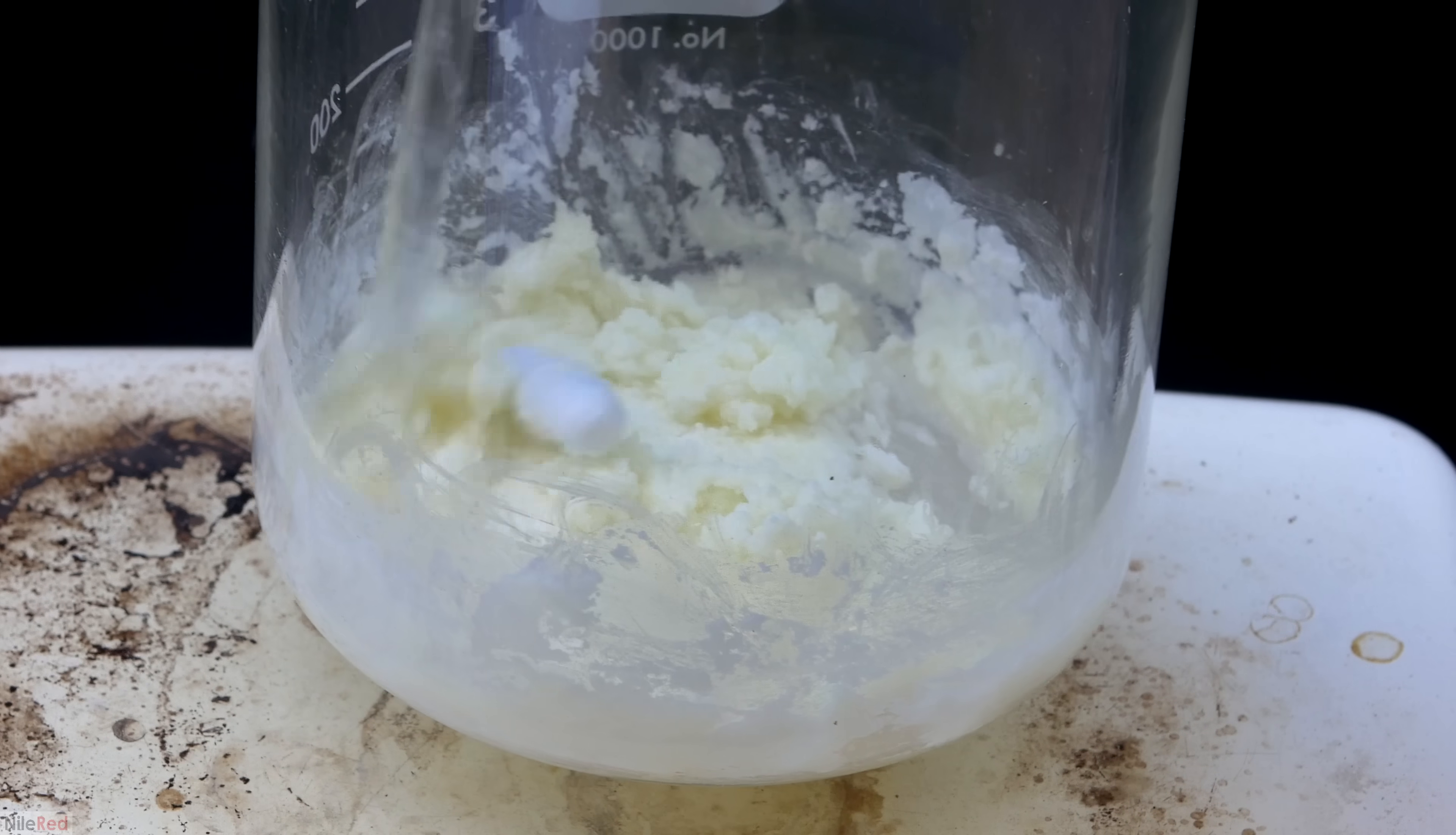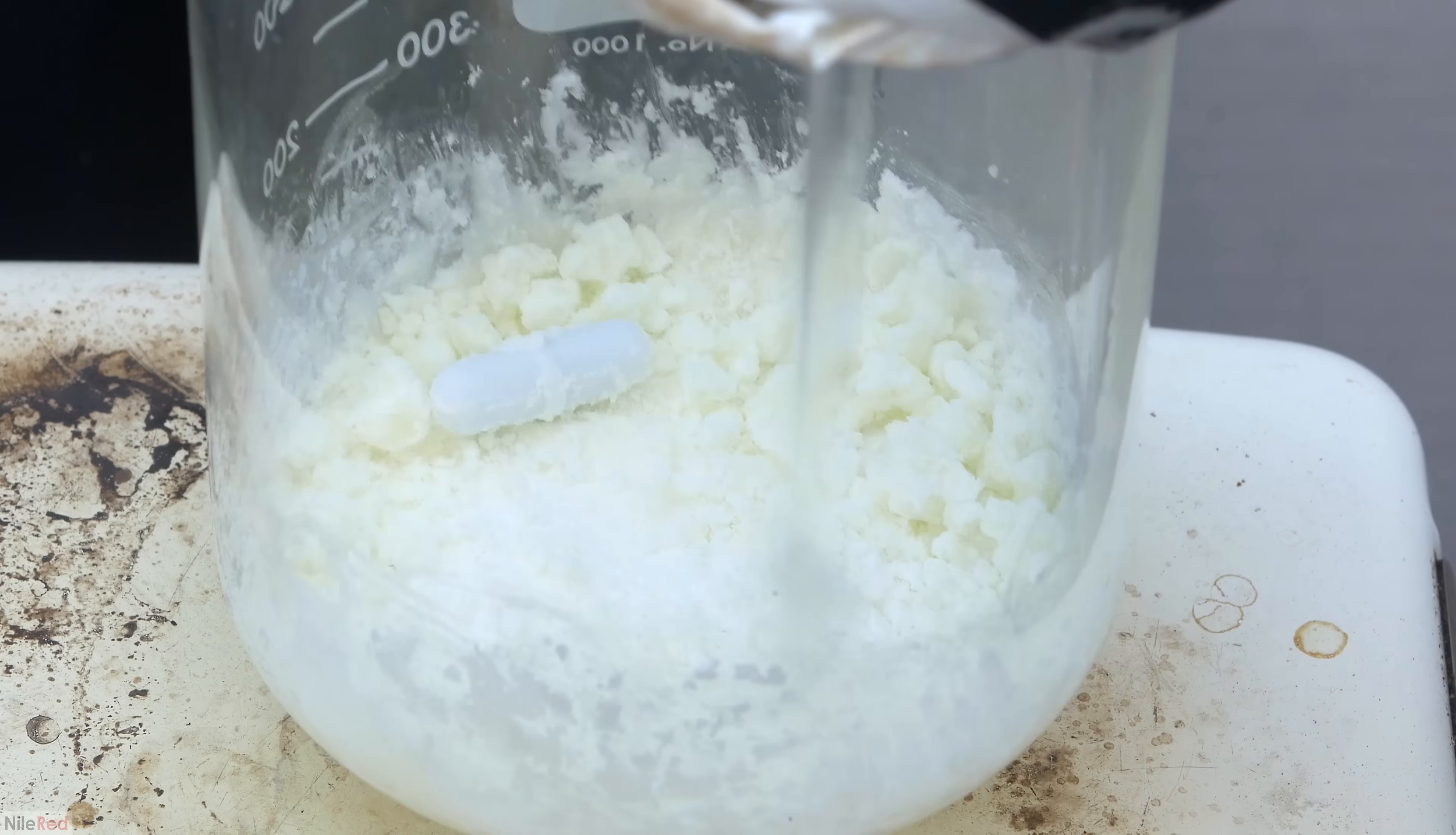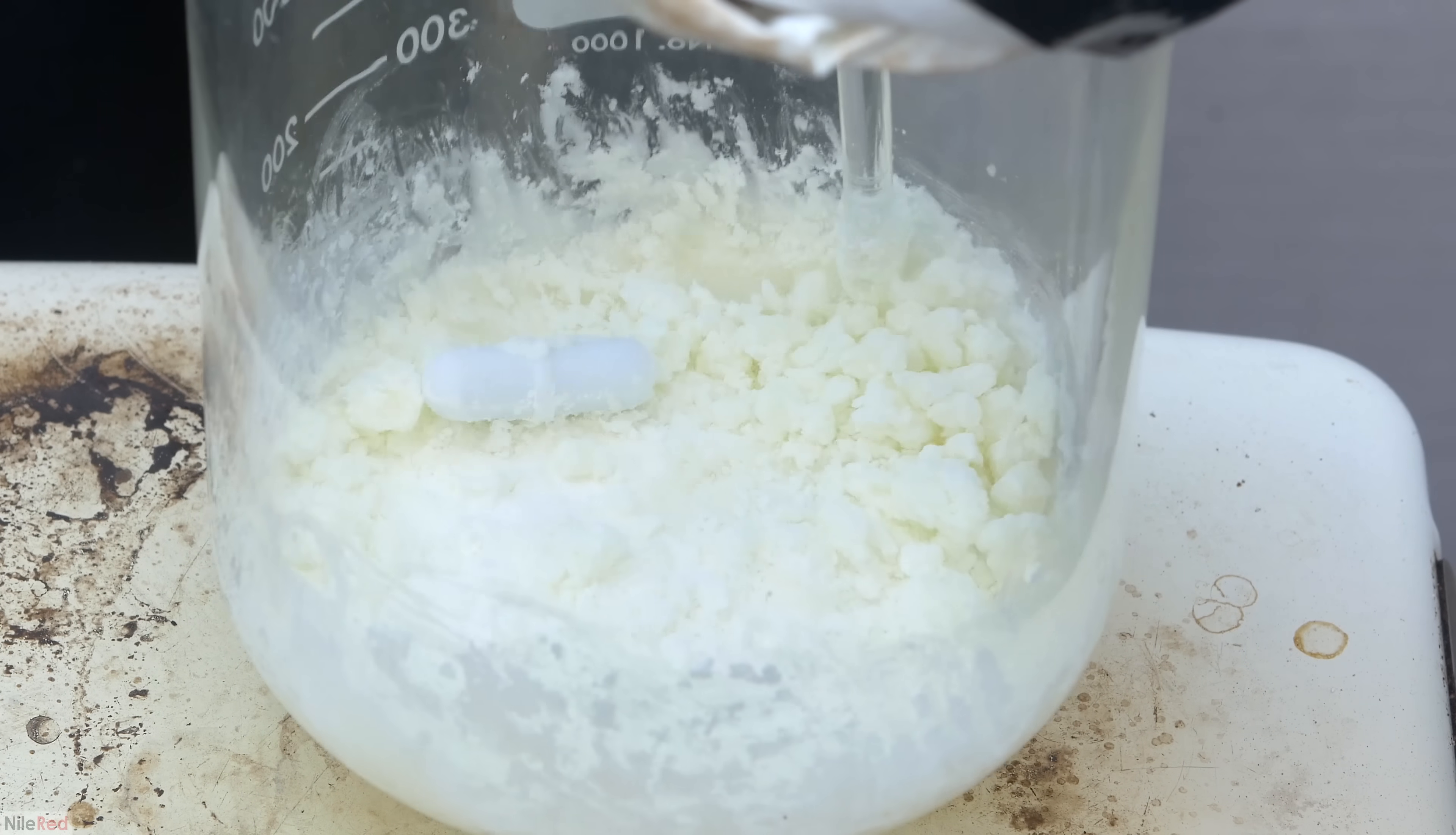As we continue to dry things, we actually got something that looked a little bit like wet scrambled eggs. When it started to look like we had a relatively dry powder, the heat was turned up to decompose the mercury(II) nitrate into mercury(II) oxide.